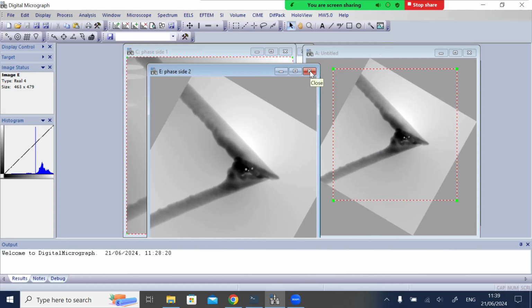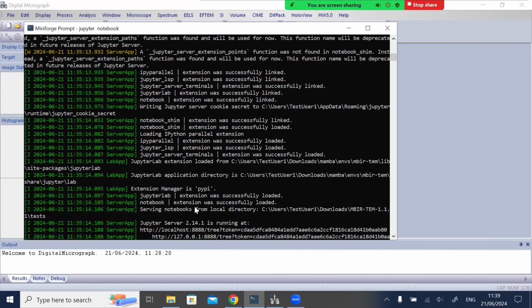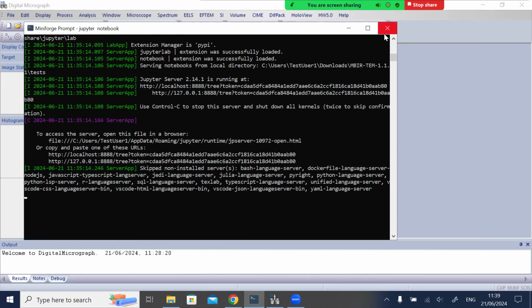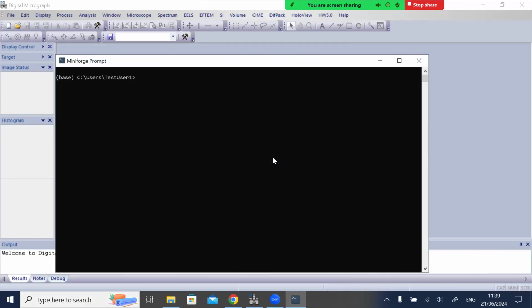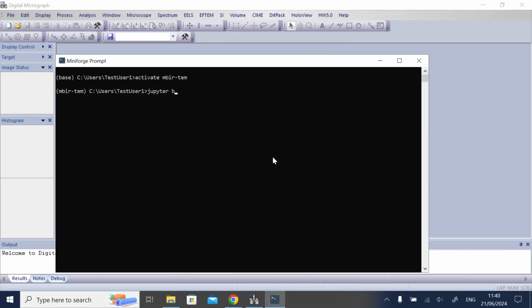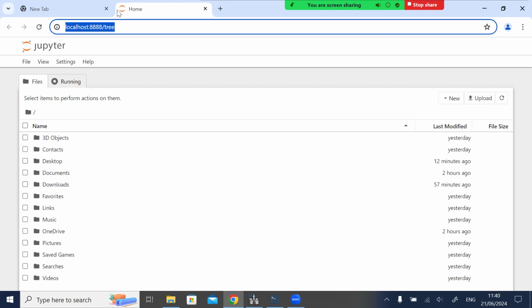Okay then, with that in place, let us restart our package manager we installed last time. Let's activate our environment. Let's launch Jupyter Notebook, because that's where all the demos for the software are written.